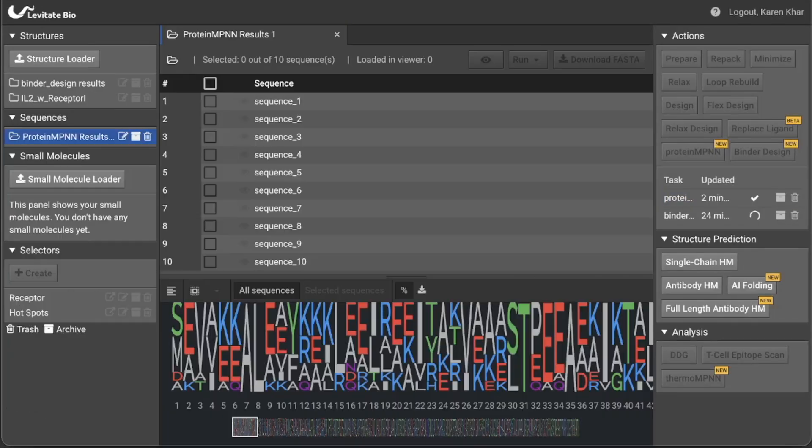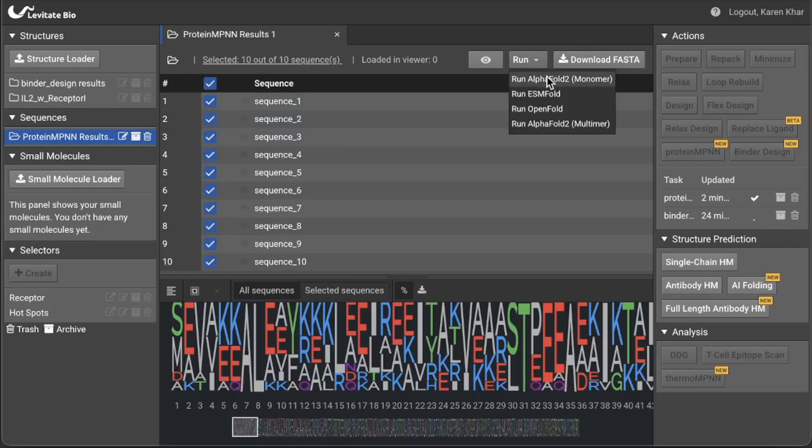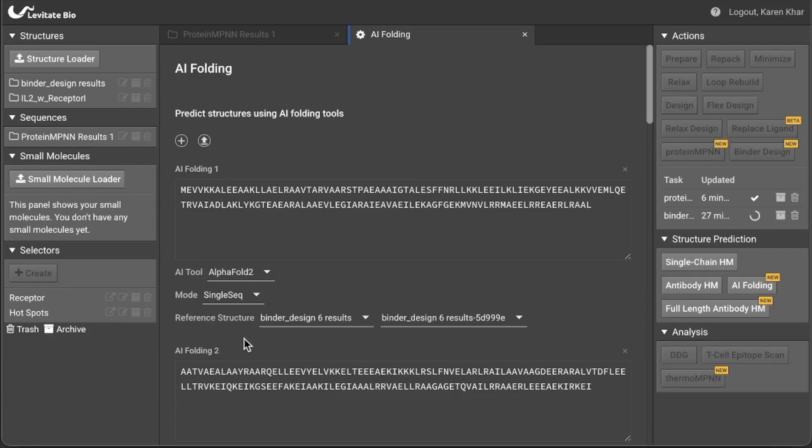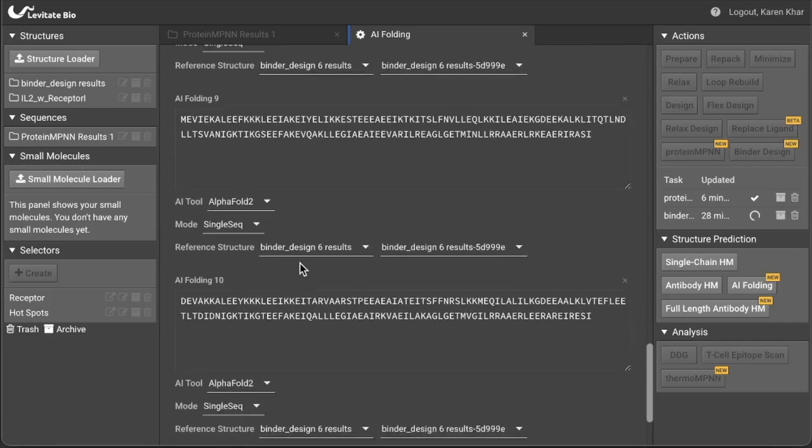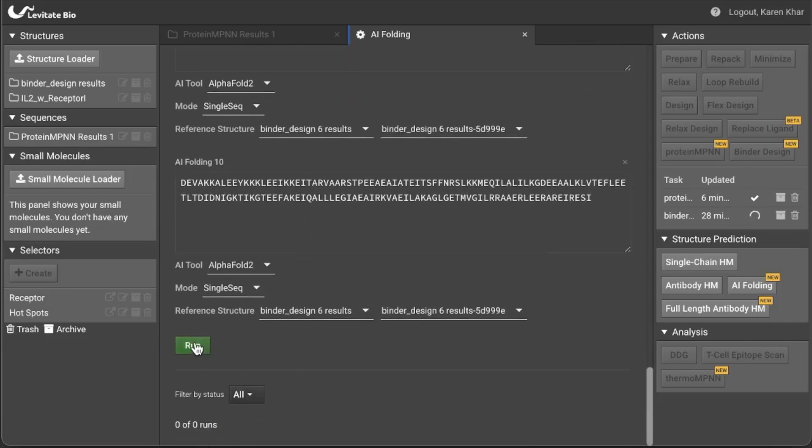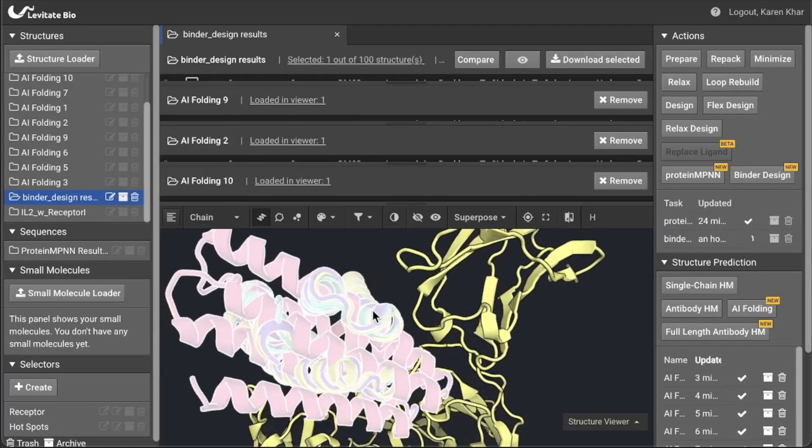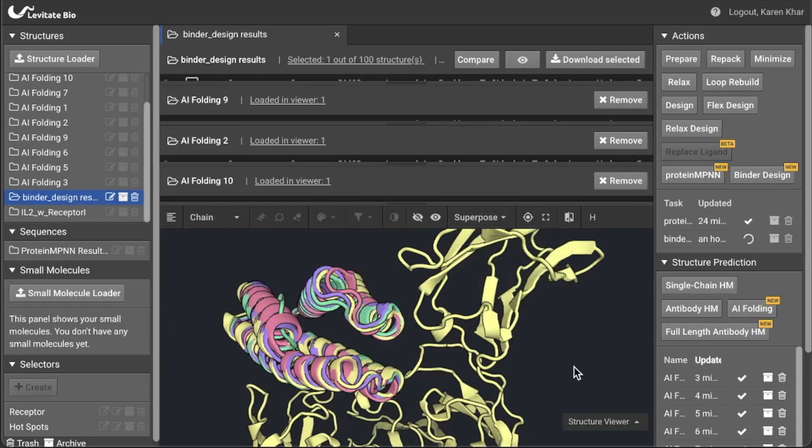The most common way to select the best sequences from Protein MPNN starts with validating whether AlphaFold agrees that the sequence will fold as expected. So click all sequences and click run AlphaFold SingleSeq, which is a variation preferred when a sequence is from a de novo protocol and not an evolved protein. Only keep the sequences that pass this filter.